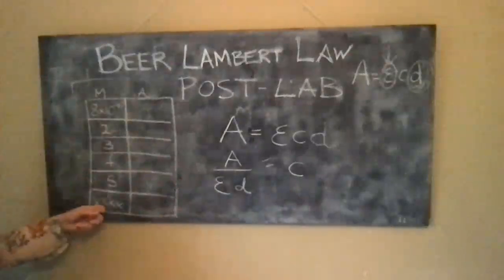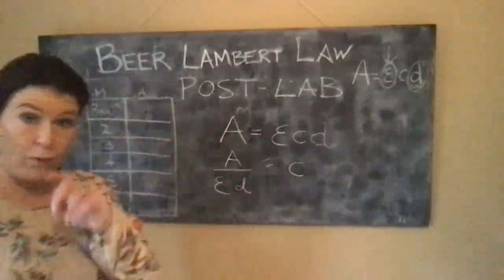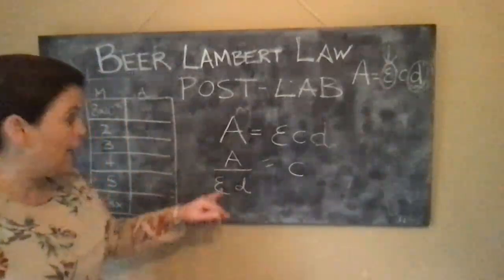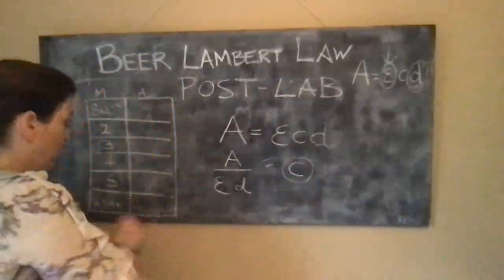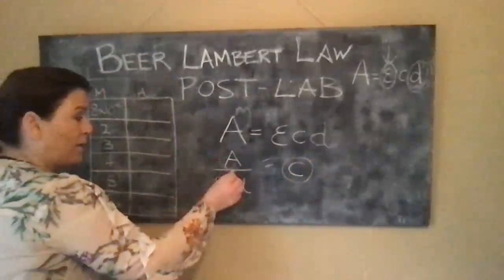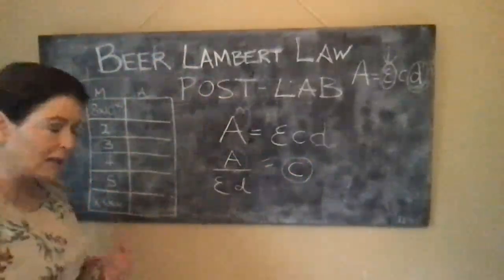So for my unknown solution down here, and for any KMnO4 solution going forward that I tested in this exact way, I could determine my concentration straight away by having my absorbance value, which you get by sticking your sample into the machine and reading the absorbance.